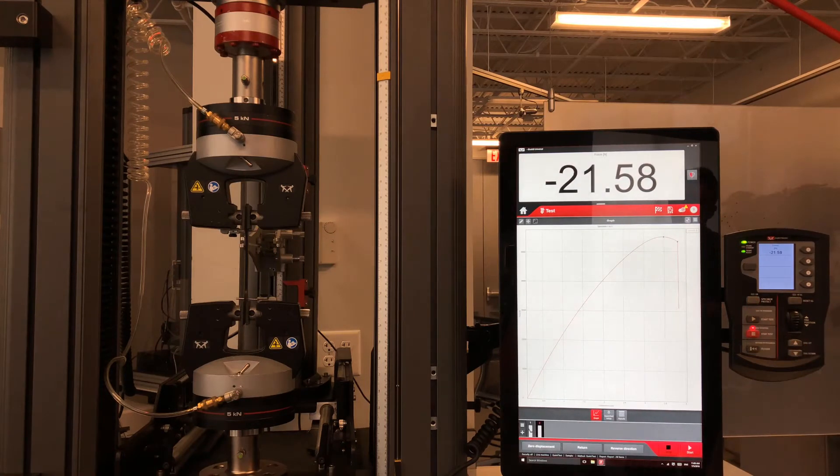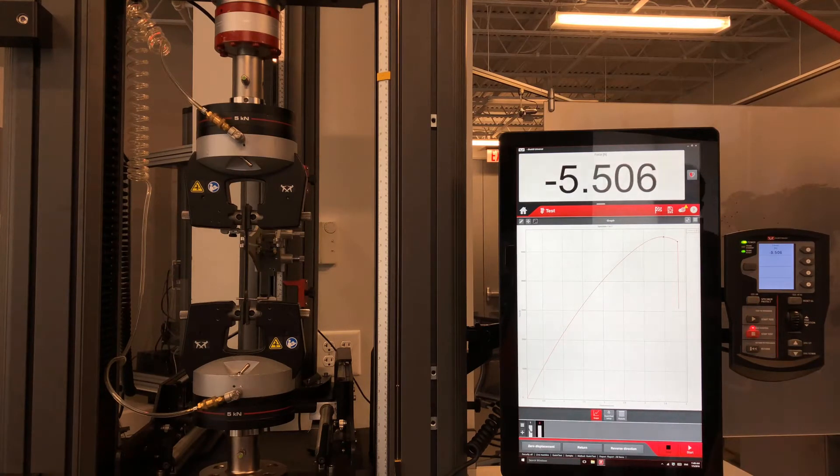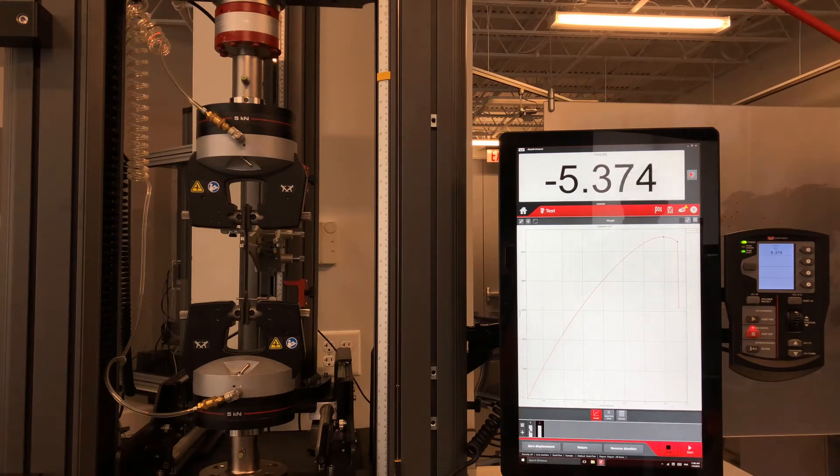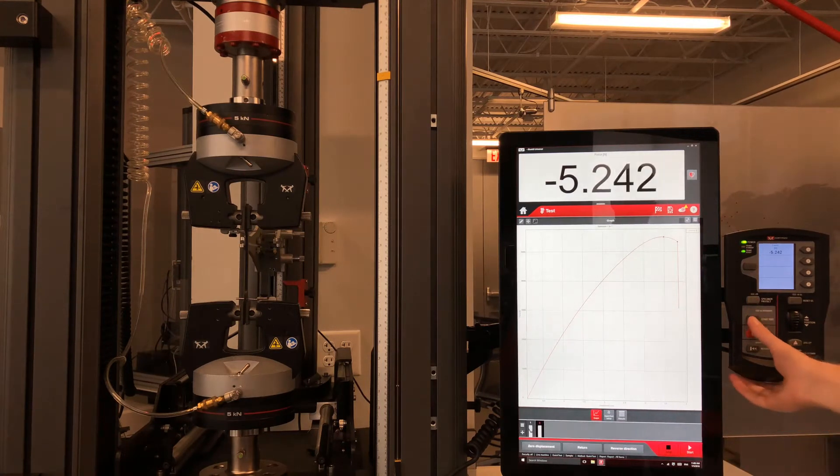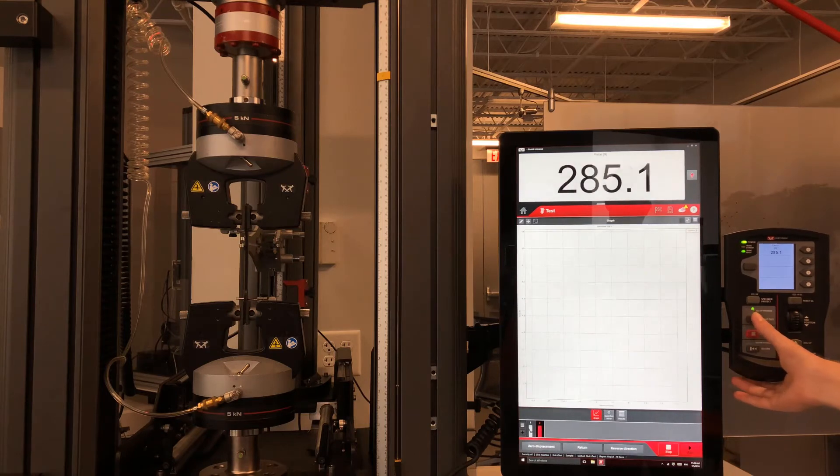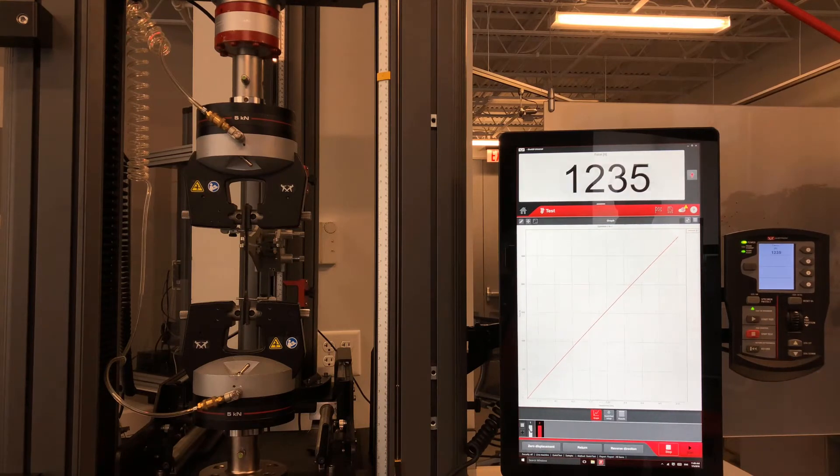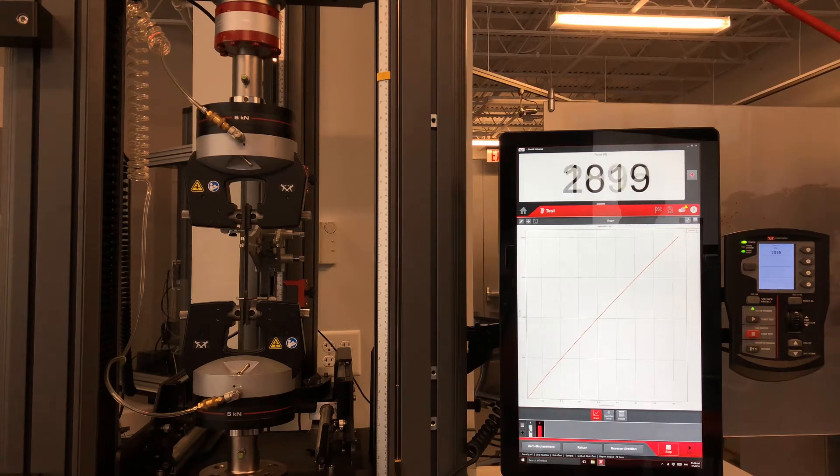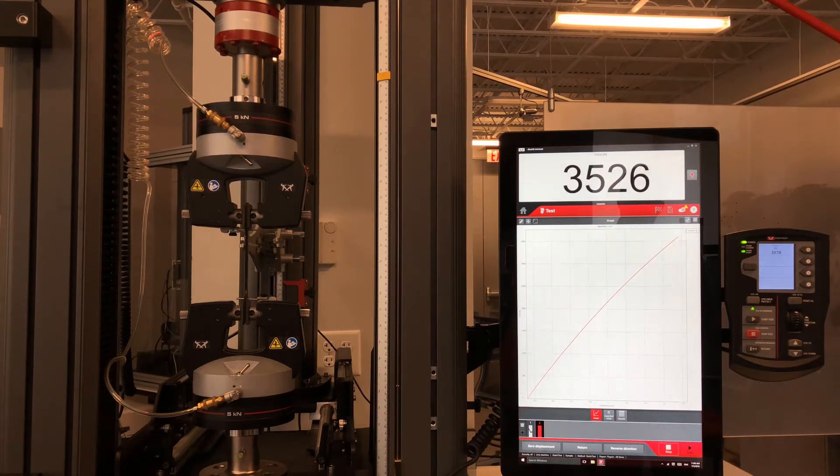By pressing the Specimen Protect button on the productivity panel, this load is automatically removed through the motion of the crosshead and a new user-defined load is maintained.